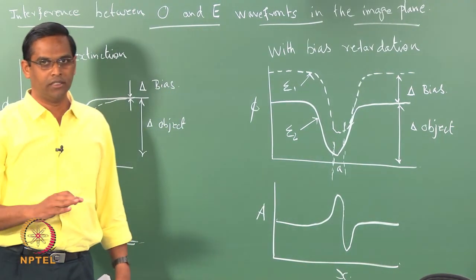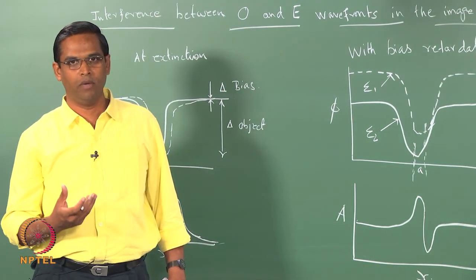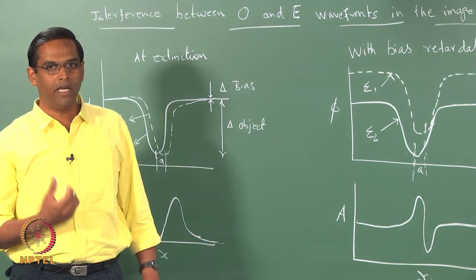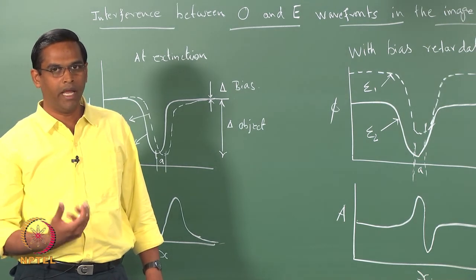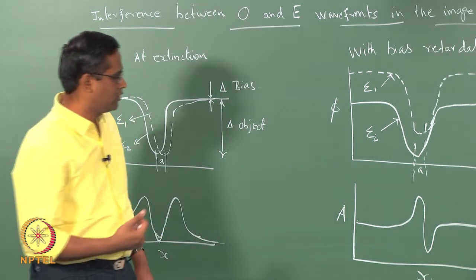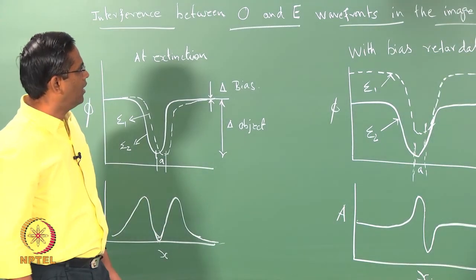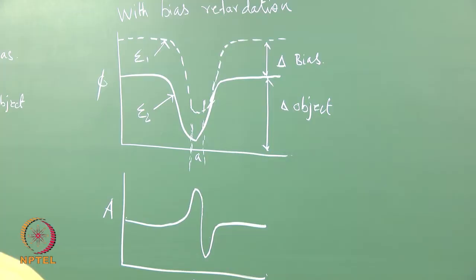So this bright and dark contrast of the constituents on the micrograph will give you a three-dimensional appeal with the gray background. So that is how you appreciate the image contrast in the DIC microscopy.